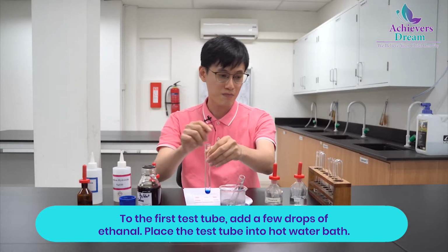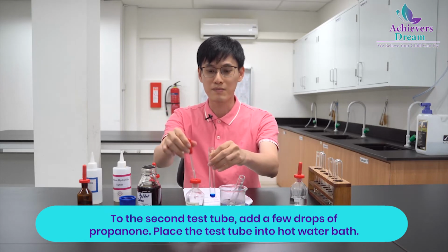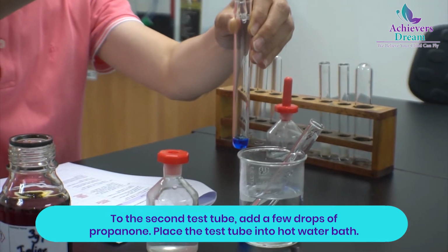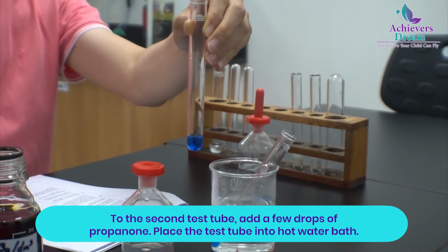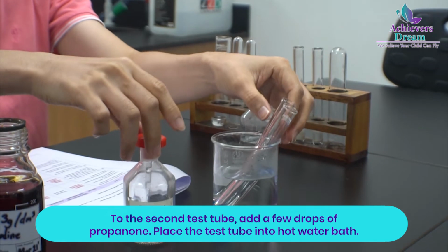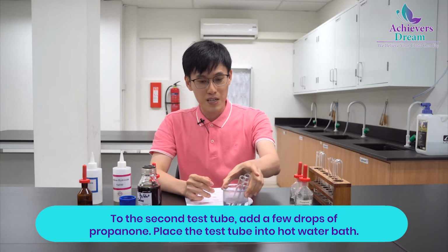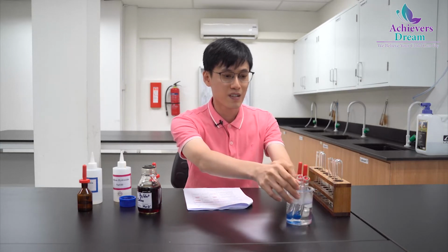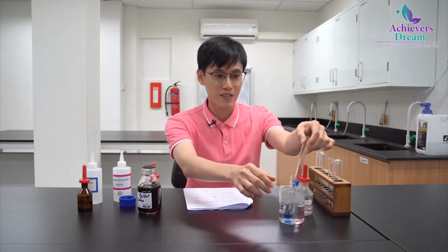I have another solution prepared, Fehling's solution, and we'll be adding some propanone to it. Propanone is a ketone. Ketones are resistant to oxidation. So when we add the ketone to Fehling's solution, even with warming, we don't expect to see any brick-red precipitate forming. So I'll just place my water bath by the side and we will observe. The right test tube is for ethanal and the left is for propanone.